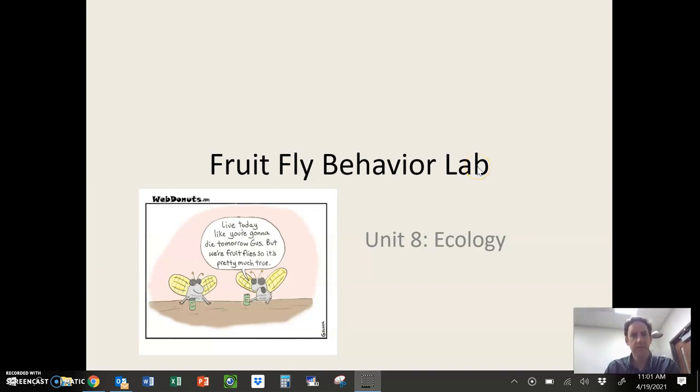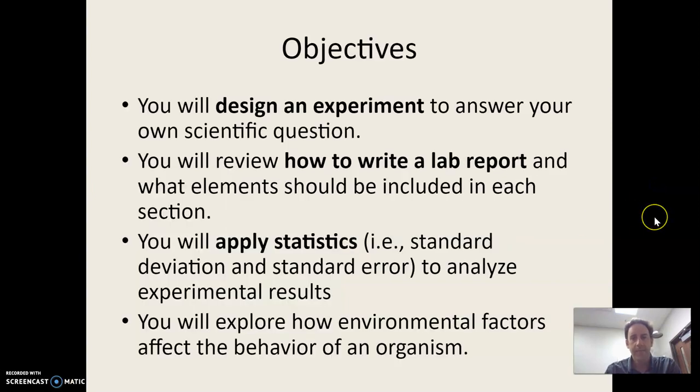Sanger live from the storeroom here, and we are going to talk about a lab called the Fruit Fly Behavior Lab that goes with our ecology unit. So you are actually going to design your own experiment in this case to answer your own scientific question.